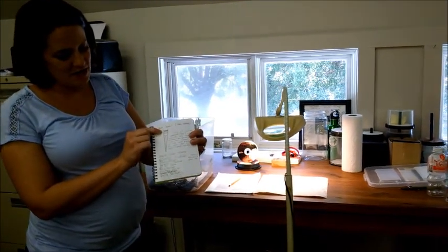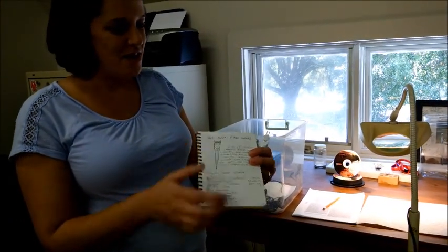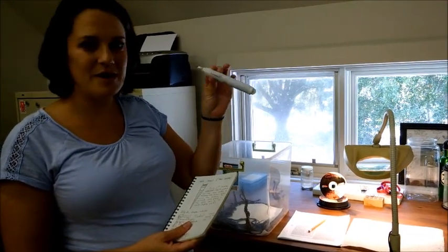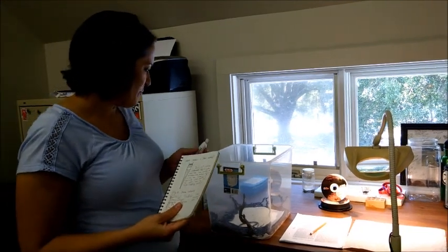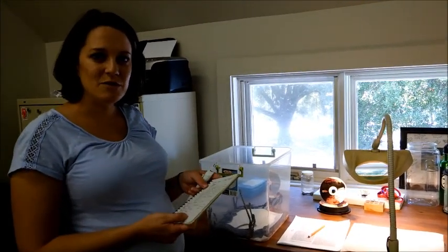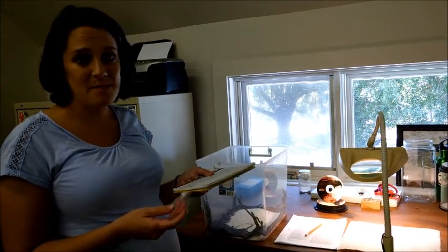So basically what we're doing is we're taking the third scale up from the vent on the bottom of the snake, and we're using this little tool. This is just a cauterizer that would be used to cauterize veins in your eye, and we burn the scale just a little bit enough so that when the snake sheds in the future, there's a permanent mark that we can see for years to come.